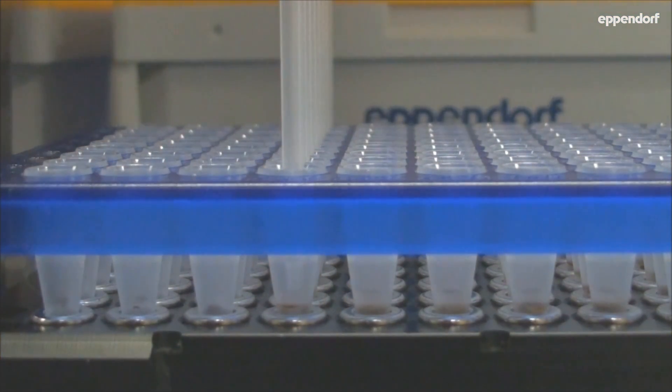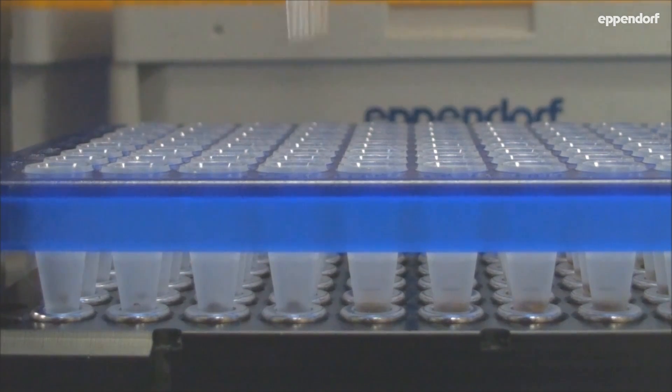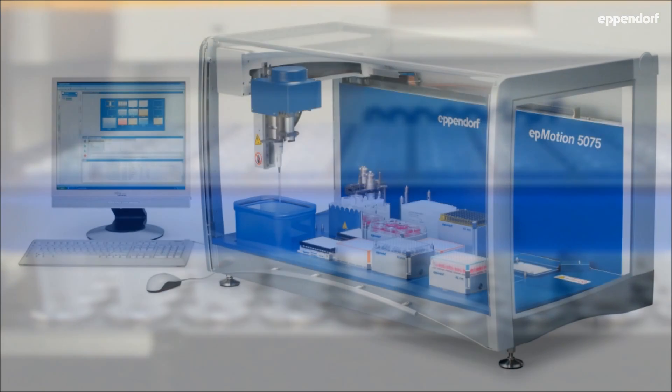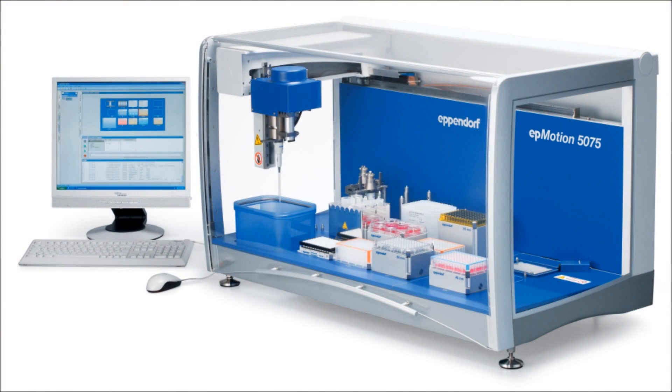Once started, EPMotion will faithfully carry out the program steps for your library preparation. All operations are recorded in log files to allow sample and volume tracing. More functionality can be obtained by adding barcode scanning. Experience what EPMotion can do for you.